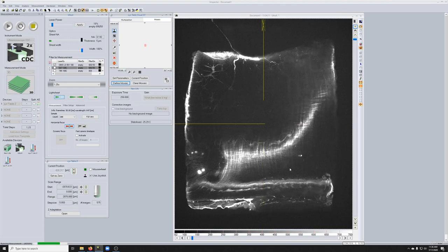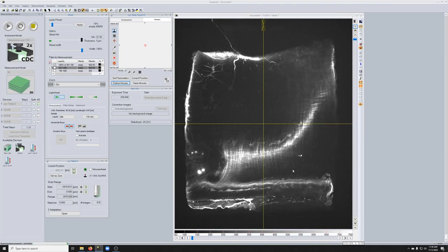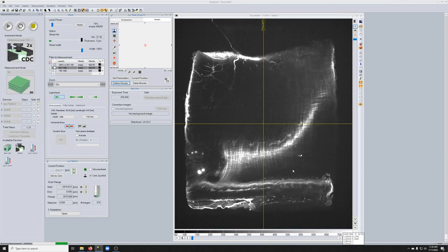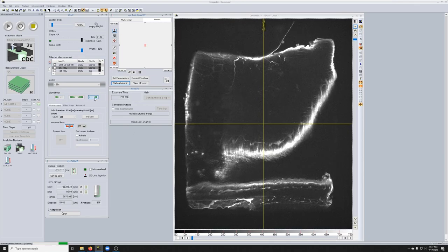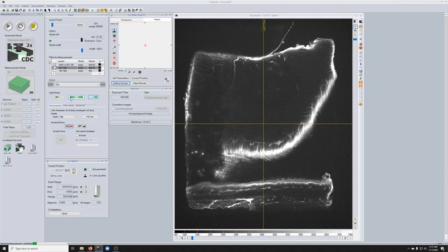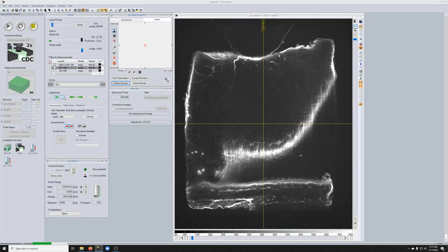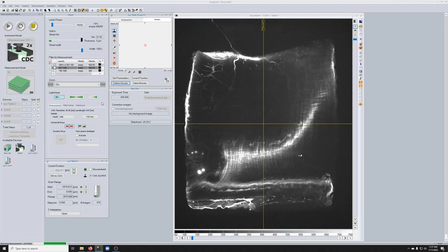And so this has to do with the fact that not all samples are cleared perfectly. And so if you're in a situation where the side from which you image a sample makes a big difference to the quality, you might want to consider imaging with both light sheets.